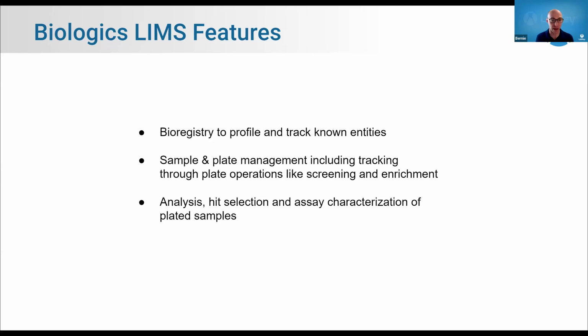We're going to talk a bit about sample and plate management, including tracking through the various plate operations, like the screen and enrichment rounds. We'll talk a little bit about capturing assay data, performing analysis and hit selection, and in general what that looks like. So with that, we're going to switch screen share here, and we are going to look at LabKey's Biologics LIMS.